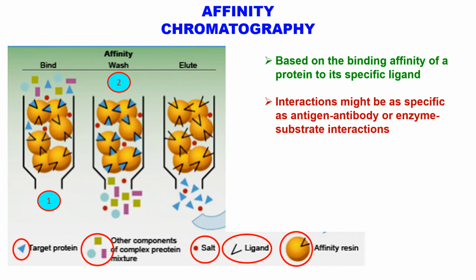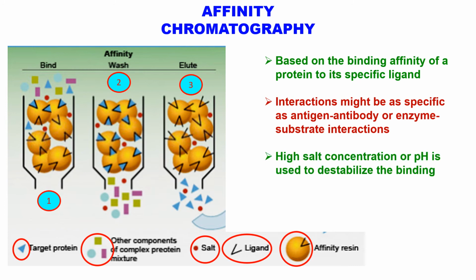And when we want to actually elute the protein, a high salt concentration or a different pH solution is used.